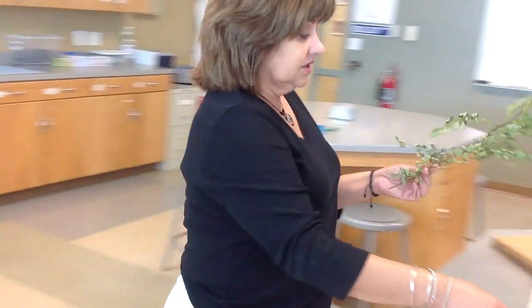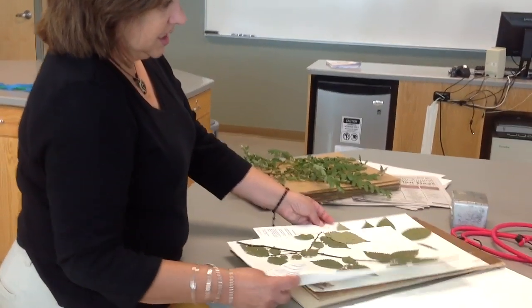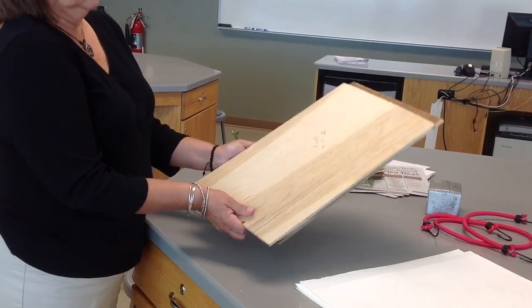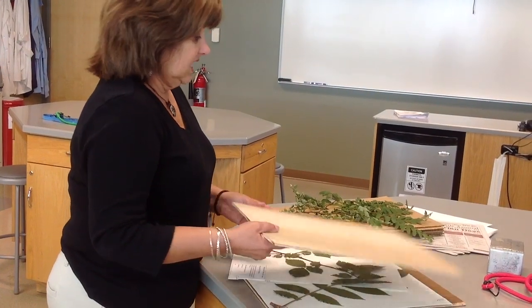The plant paper is about the same size as the plant press. So if you have a significant amount of plant material hanging out of the press, your sample is probably too large. We need to make something fit in there.